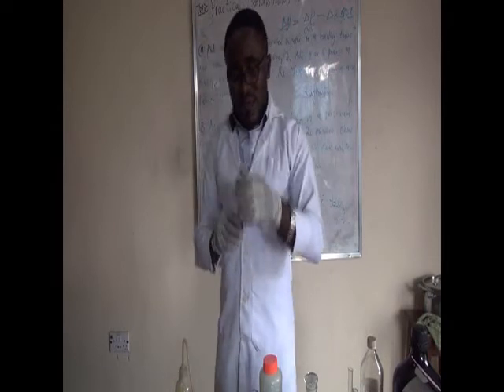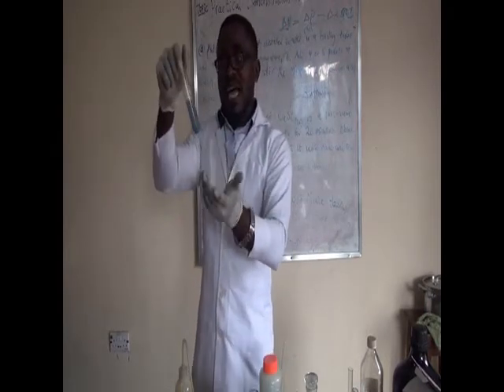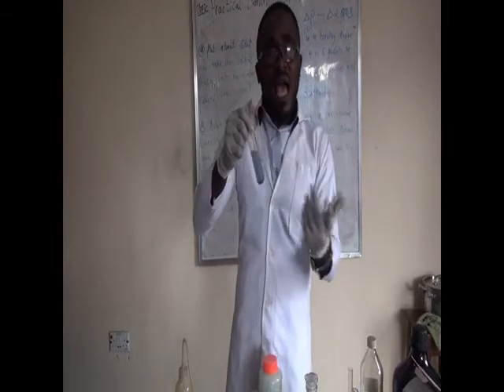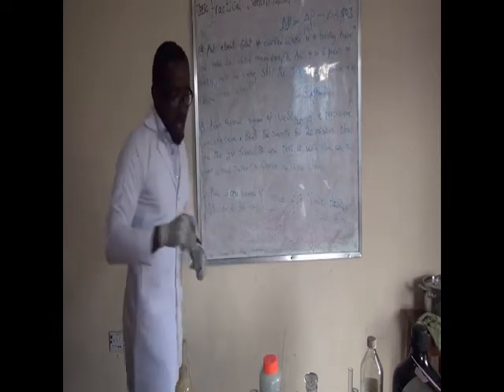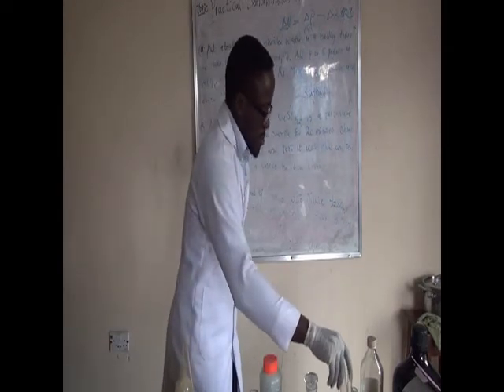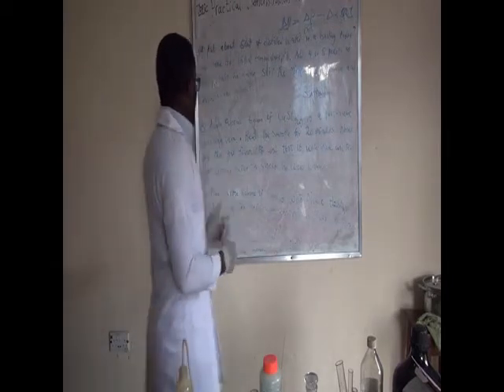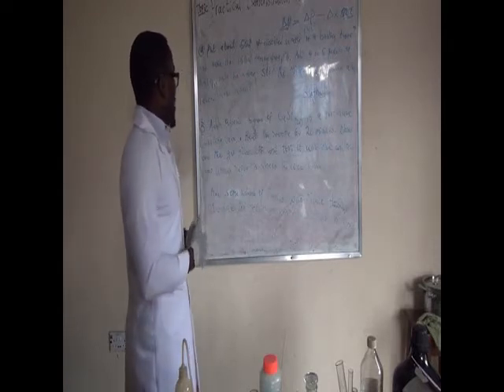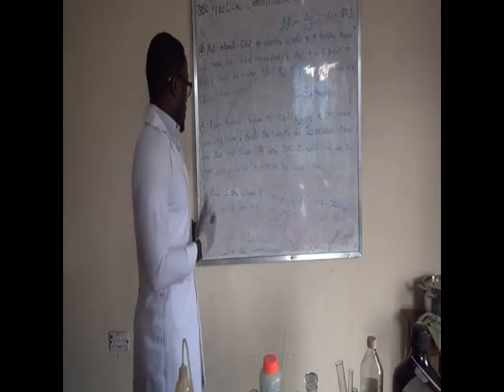So let's consider the first experimental aspect, and we observe that the sodium hydroxide pellet has completely dissolved in water and heat is being generated to the environment. That is the first confirmatory test for exothermic reaction. Now let's go to the next one. The next one says add about 5 grams of copper sulfate in a test tube or boiling tube. Heat the sample for 20 minutes, observe the gas given off, and test it with blue and red litmus paper to check the color change.